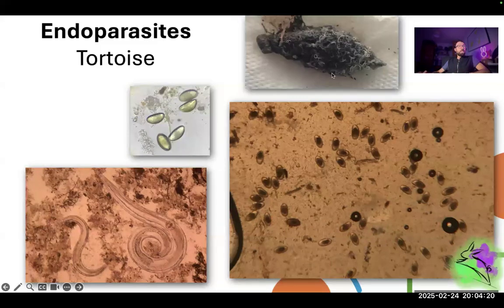And as you can see in this sample, these tiny worms are visible to the naked eye, even if they are still quite small, but in this case, the number of these parasites was too high. Usually just a few eggs are not a problem, but this also depends on the experience of the vet. But when there are too many, both oocysts in the feces or eggs in the sample, like in the bigger picture where all the oval shapes you can see are eggs, in this case obviously treatment is needed.